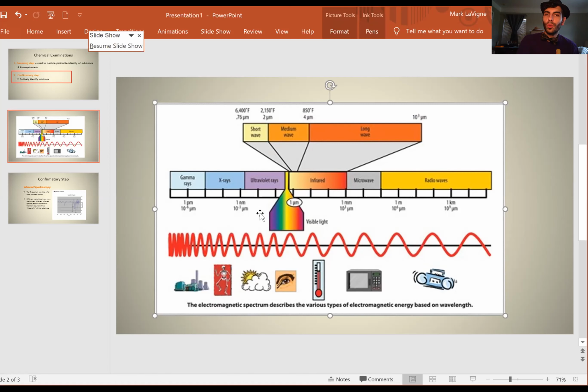So when I talk about the visible light spectrum, I'm talking about this area right here. We think of the visible light spectrum usually in terms of the Pink Floyd album with the prism, where white light is hitting it and it splits into its ROY G. BIV, or red, orange, yellow, green, blue, indigo, violet. So white light exists in a spectrum, in colors.